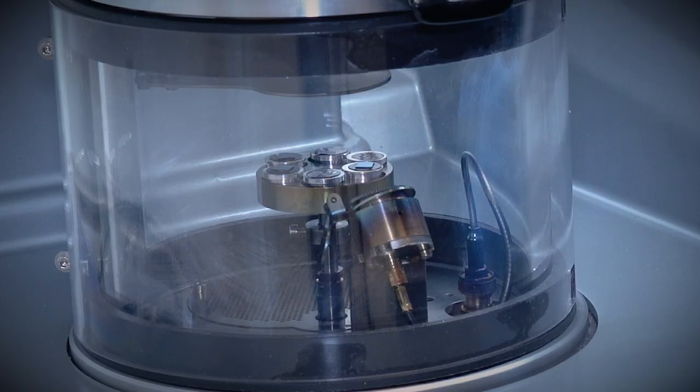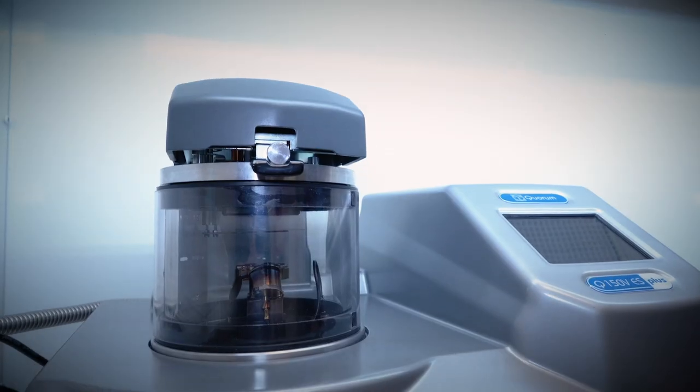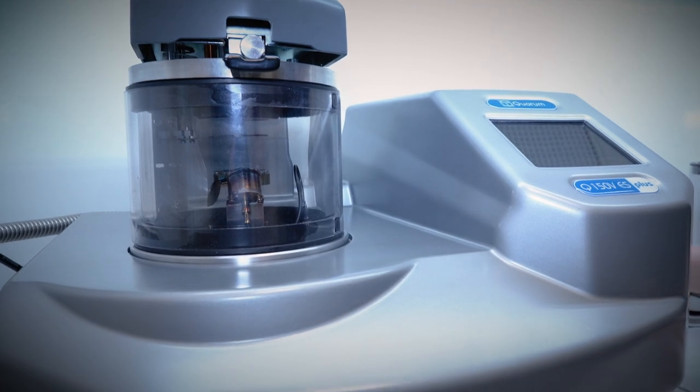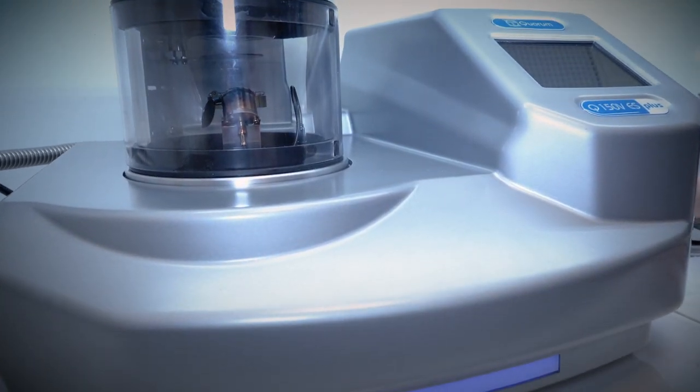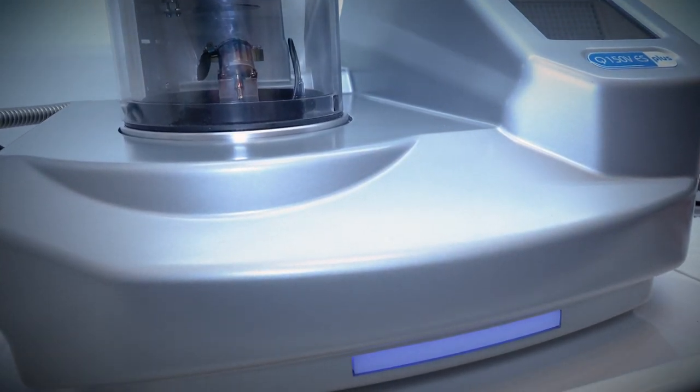The Q150 V Plus uses low temperature enhanced plasma magnetrons optimized for the turbomolecular pump pressures combined with low current and deposition control which ensures your sample is protected and uniformly coated.